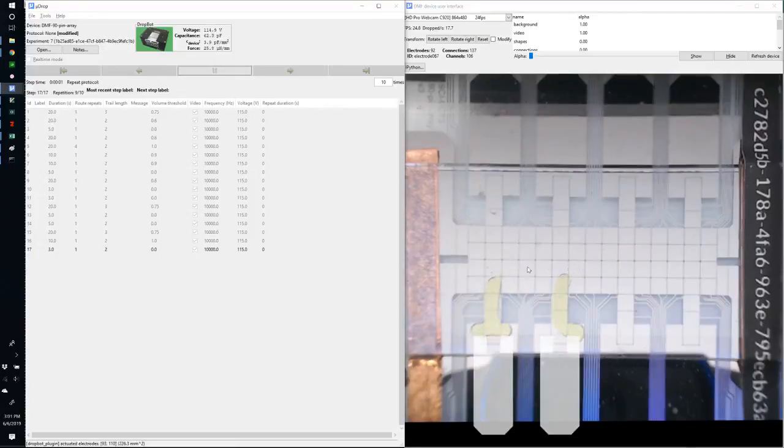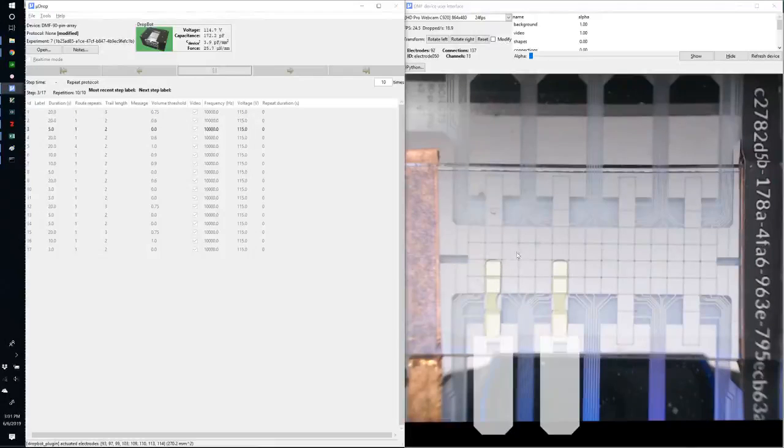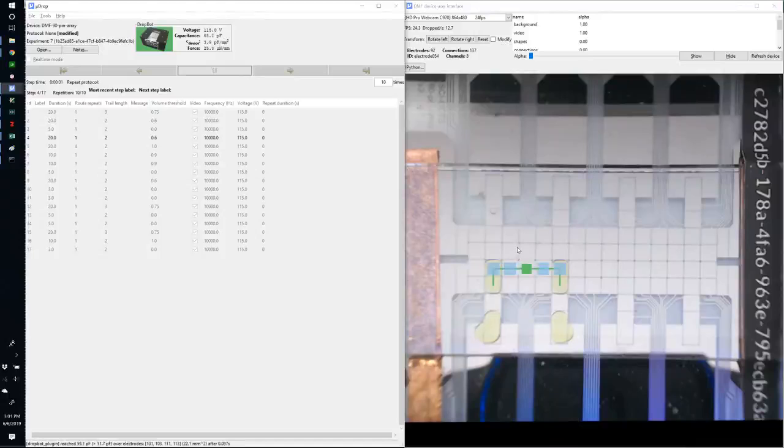Now, as I mentioned, the split that's performed after the mixing is repeatably a larger daughter droplet on the left-hand side. And so this suggests that it's a property of the chip and the electrodes on the chip, and maybe the surface, so different factors on the chip, and not of the liquid. And so we'll see again that when it splits, we seem to get more volume on the left daughter droplet.